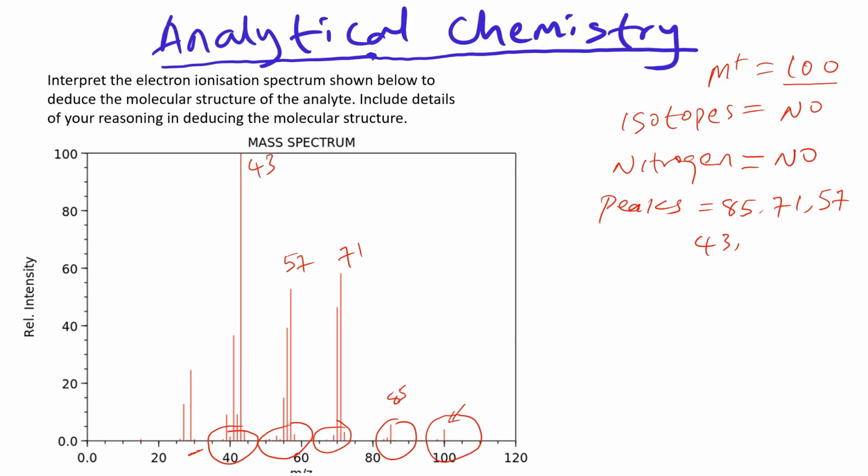And let's look at this cluster here. We have a peak at 29. And if you look here, there's a small peak at 15.